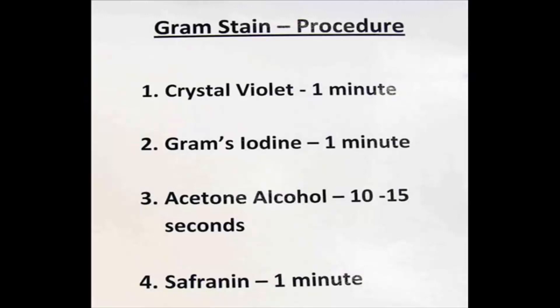Third step is to apply acetone alcohol. This is a decolorizer. It will remove the purple stain from my Gram-negative bacteria. I run that over the slide for 10 to 15 seconds and then rinse.